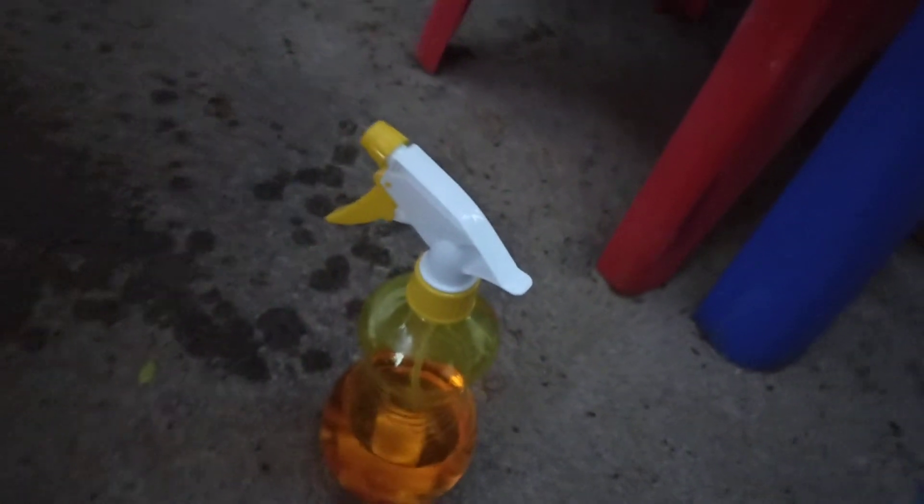We are going to let it sit for a while and come back. We should get a layer on the bottom. Let it sit for maybe at least a half hour and then we will come back and check it.